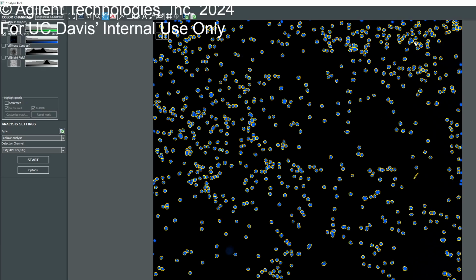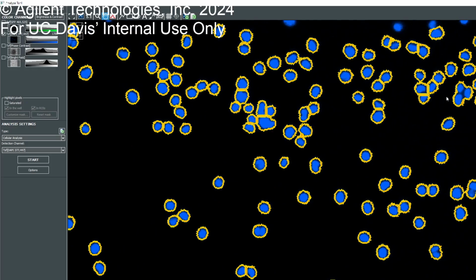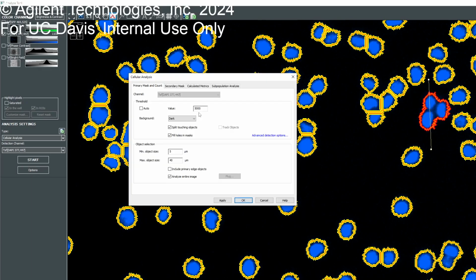Is that an issue, or do you think it's fine? Yeah, we can try to resolve that. So if you scroll up and zoom in there, draw a line profile tool across maybe these two cells. This and this would be easier, I think. Okay. So now we see two peaks, and 25% is 14,000 basically. So you can go to the options tab and set it at 14,000 for now. Click OK.